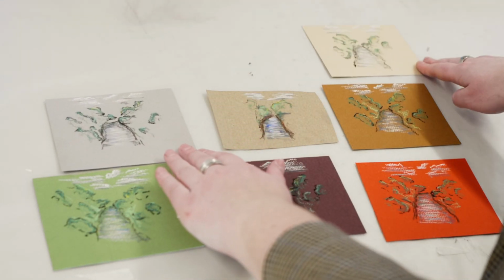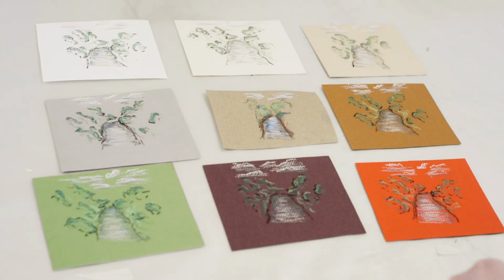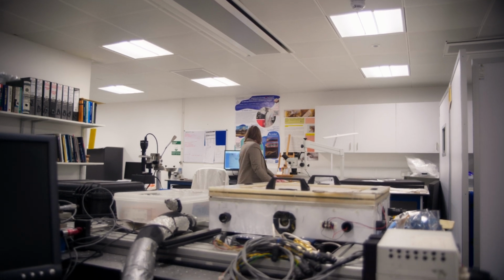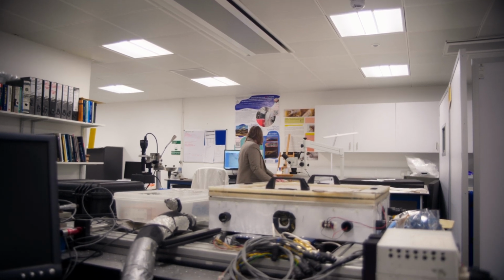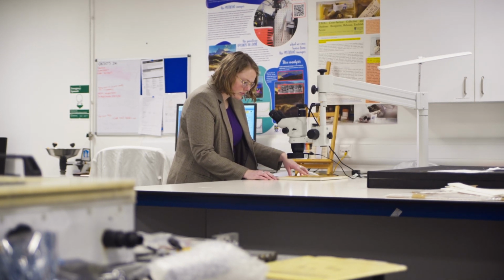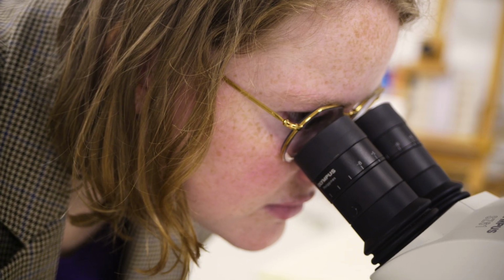Technical analysis involves looking at the object in a variety of ways. So it starts off very simply by just looking at the object and seeing what you can see with your naked eye. What do you notice? Is there anything that stands out to you immediately? Is there something odd, like can you see pinholes? Can you see that there's an abrasion somewhere? And that can be followed up by looking at it in more detail with a microscope. Is there more layering? Are there more colours than you thought initially? Because when you get closer up, you can actually distinguish better between colours.